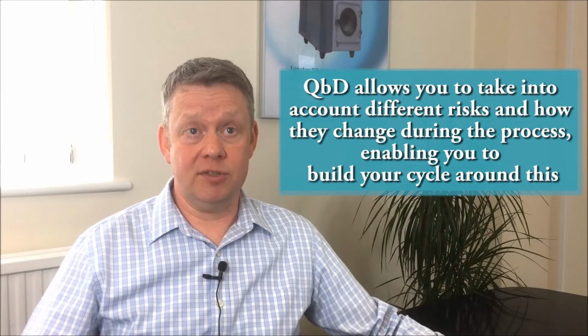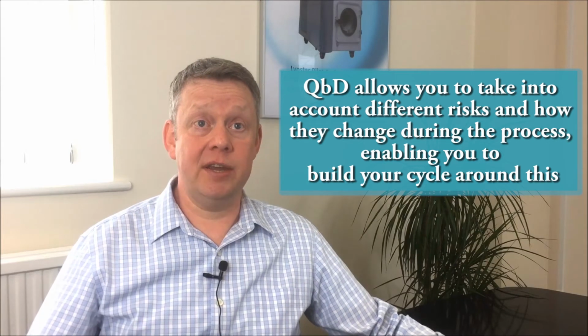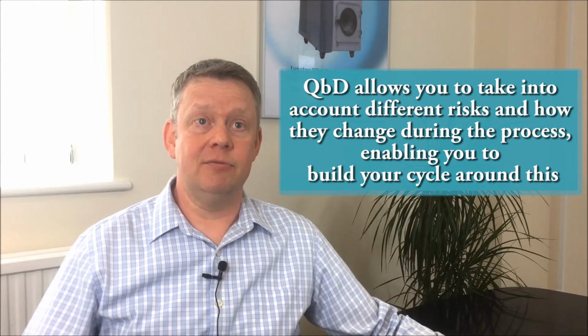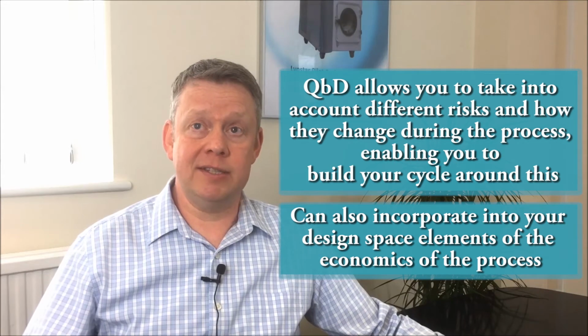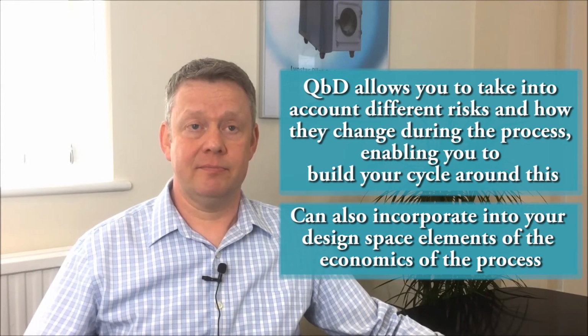But perhaps in the beginning of primary drying, you might be challenging the trapping rate of your condenser in your freeze dryer, but at the end of the process you won't be, so the risks are different. And what QbD allows you to do is to try to take into account the different risks and how they change during the process, and build your cycle around reducing the risk from both the equipment and the product, and you can also incorporate into your design space perhaps elements of the economics of the process.